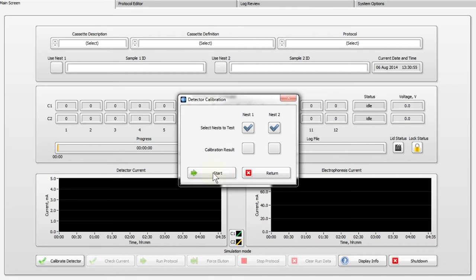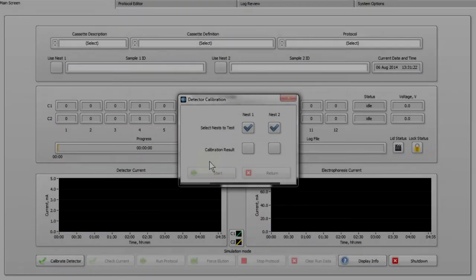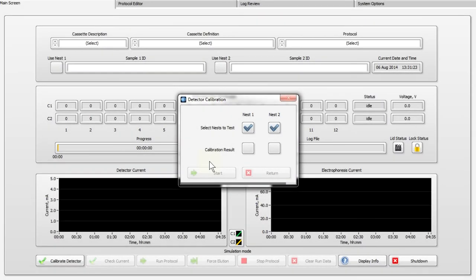A progress bar at the bottom of the window will indicate the progress of the calibration. When complete, the Calibration Result window will show a green checkmark indicating a successful calibration.